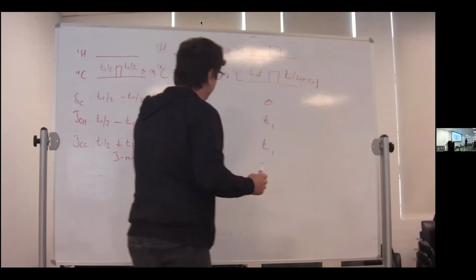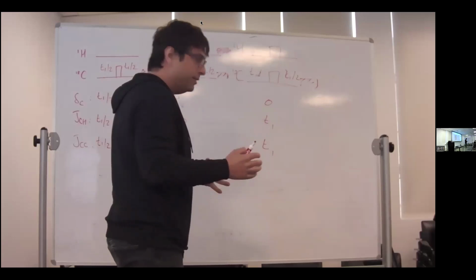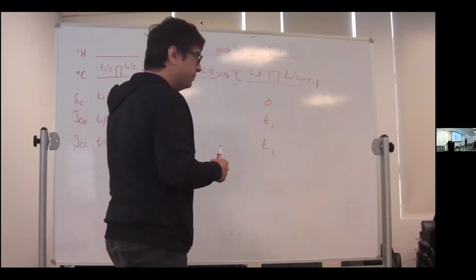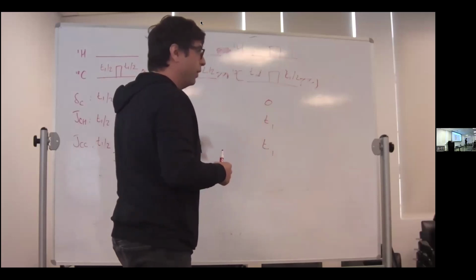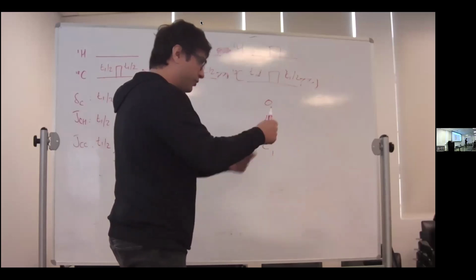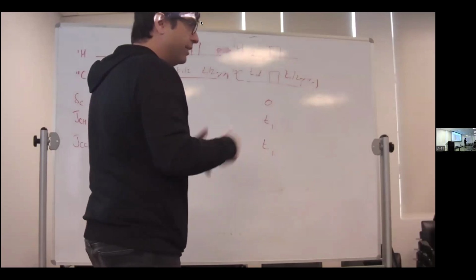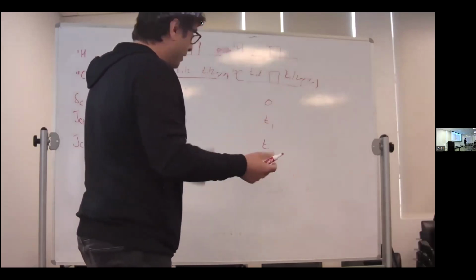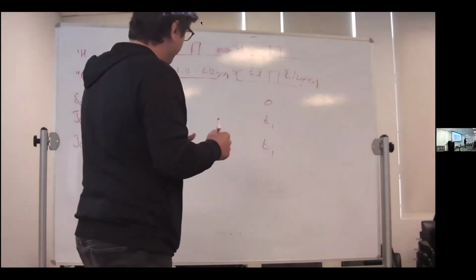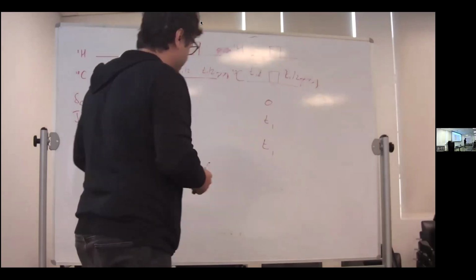Right? So when you are designing an experiment in order to measure splittings, you can worry about the various evolutions and just make sure you put the right selective 180s and pick and choose things correctly to ensure that you only allow those couplings that you might want to be interested in measuring. And then you can use the IPAP principle to create, we'll go over that, to measure either in-phase or anti-phase magnetization, so you can add and subtract and get the various components separate.